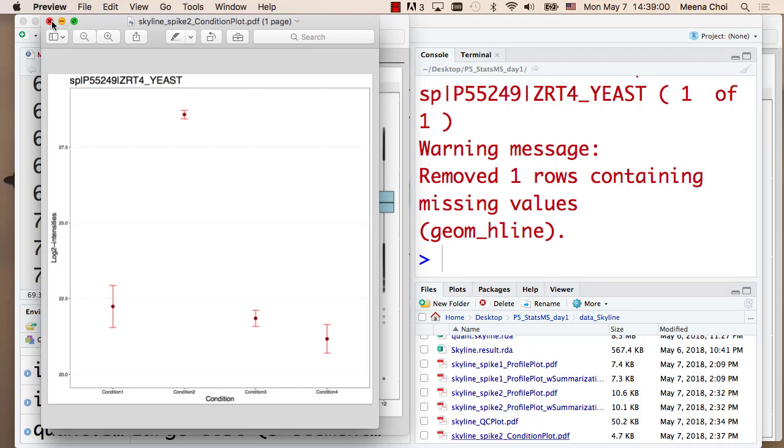You can draw any kind of error, but this is not our recommendation, because we use this summarized value for more advanced statistical analysis in the next step. After the next step, we also provide how to summarize based on variation calculation. So this is not our recommendation, just to give you a brief idea. We are going to work on that in the next step. Okay, so far? Then let's move on to OpenMS.